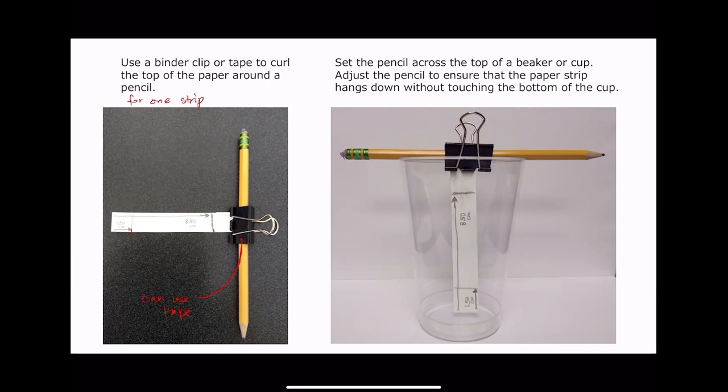So you want to check now. You have to have 1 cup that is where you're going to run the experiment in. It doesn't have to be a clear cup, but here's my cup. And so you want to check the length of that chromatography strip in that cup. Basically the strip should not touch the bottom or the sides of the cup. You want that strip to hang down, and it should be straight up and down. It shouldn't be at an angle.